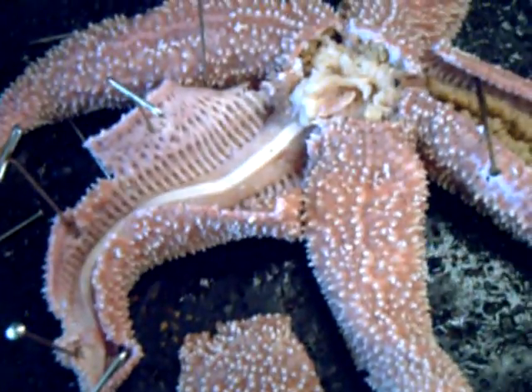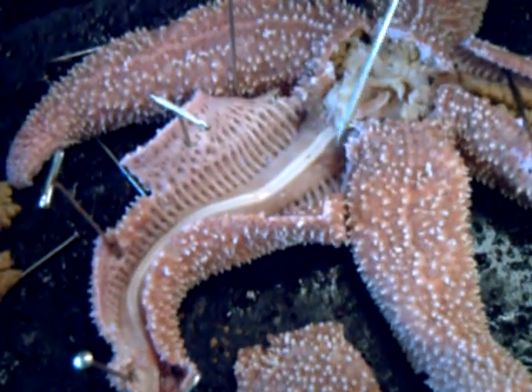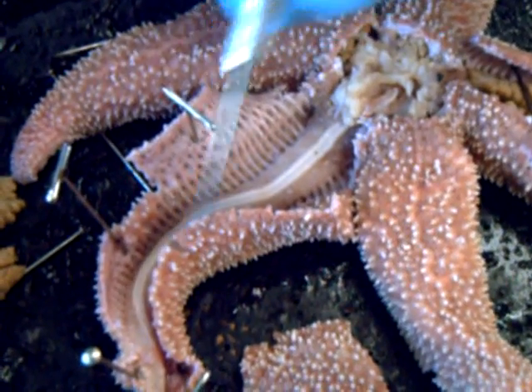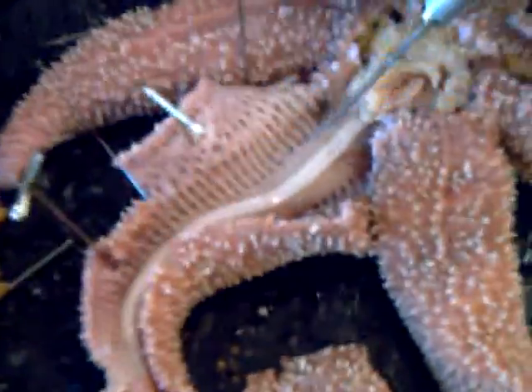There's this hard... what's it called? It's called the... ambulacral ridge. Ambulacral ridge. Never mind, it sounds religious. There's that. It goes through here.